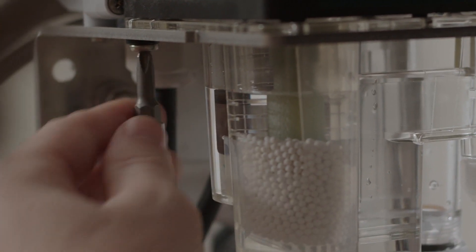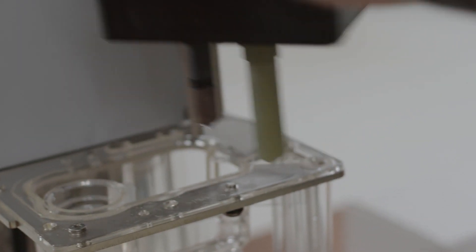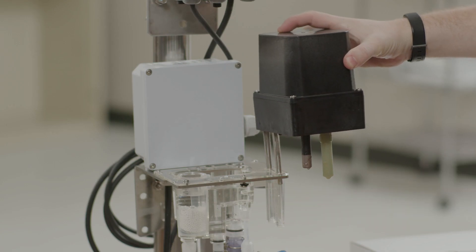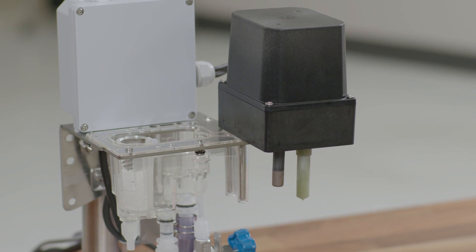You can lift the electrode assembly off and put it into maintenance position, which is where the two slots to the right of the flow cell align with the two pins on the measurement assembly. With the electrode assembly in the maintenance position, this gives you access to the flow cell.